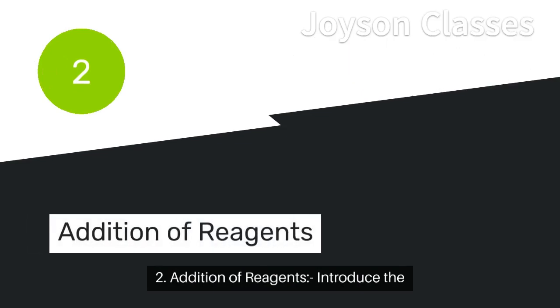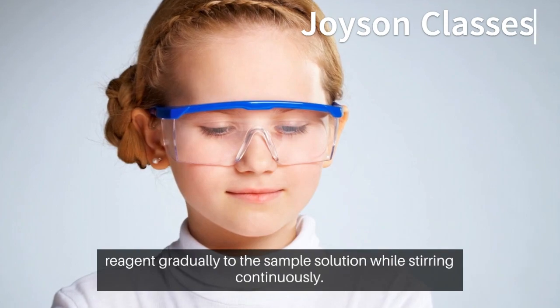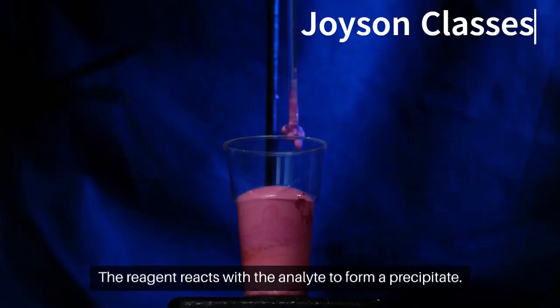2. Addition of reagents. Introduce the reagent gradually to the sample solution while stirring continuously. The reagent reacts with the analyte to form a precipitate.